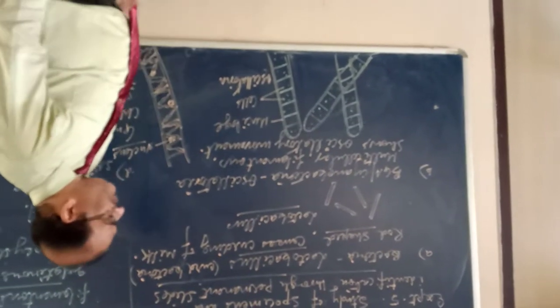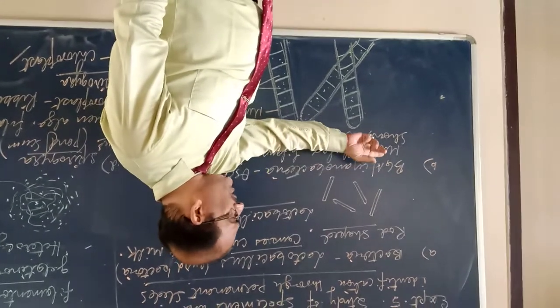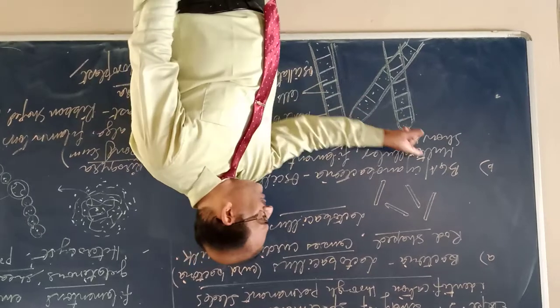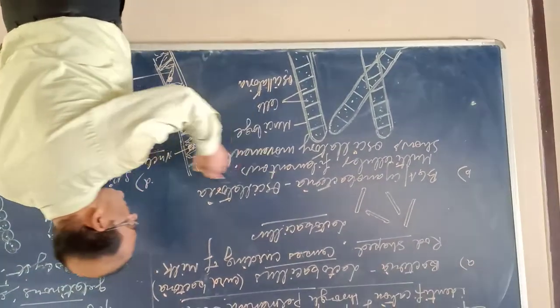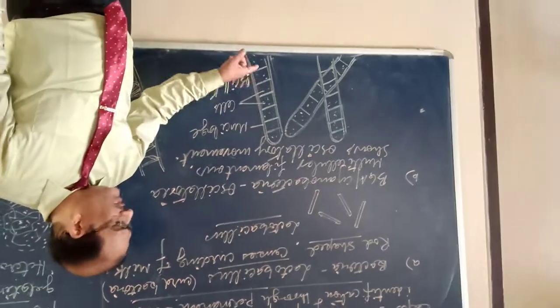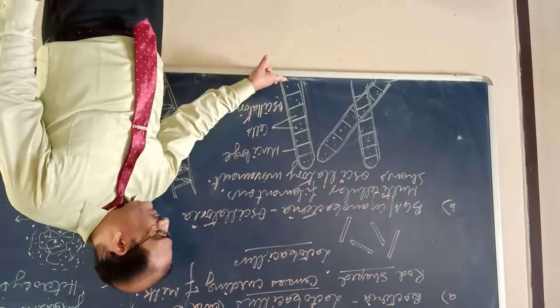Now the next slide is of BGA. Blue-green algae bacteria belong to Monera. They don't possess what? Nucleus and membrane-bound cell organelles. Now the next slide is of BGA, and we are going to discuss the slide of Oscillatoria. Oscillatoria is a kind of filamentous multicellular BGA.